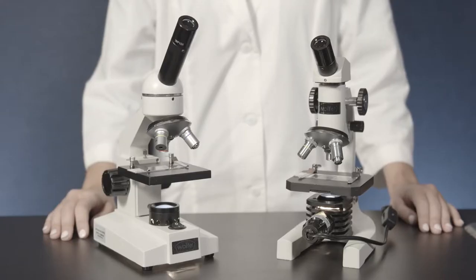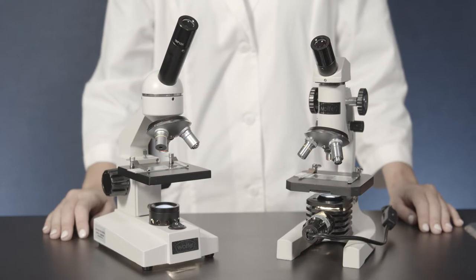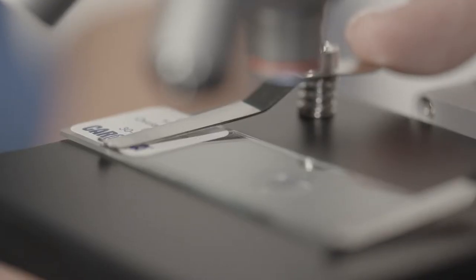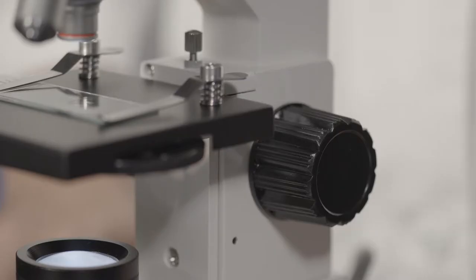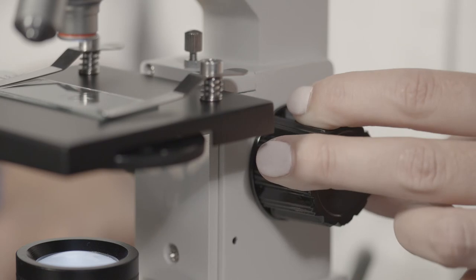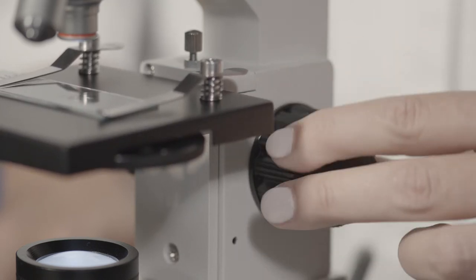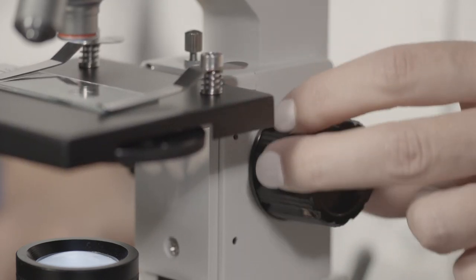Our Wolf-Inclined Student Microscope, item 591205, is designed with simplicity in mind while maintaining a rugged, all-metal frame. The microscope uses standard stage clips and one set of focus controls. The single set of controls simplifies the focus process and makes it easier for younger students.